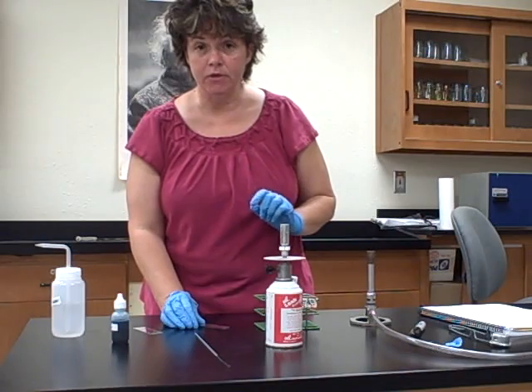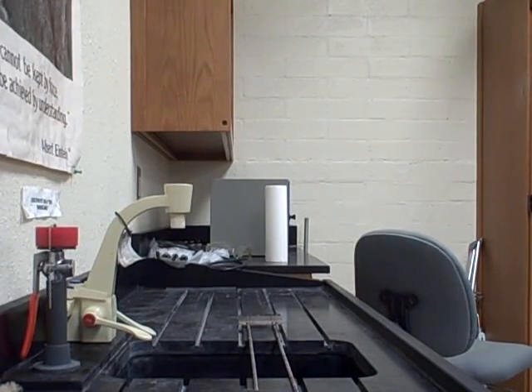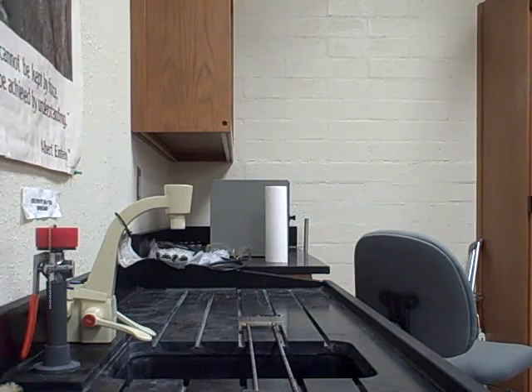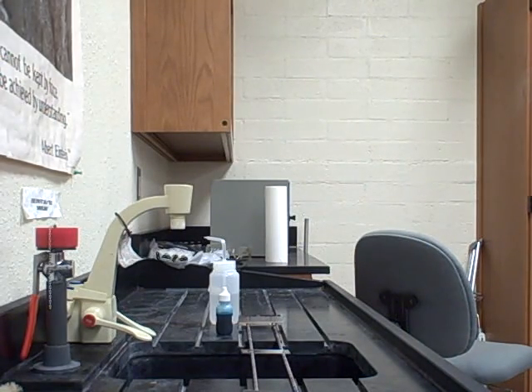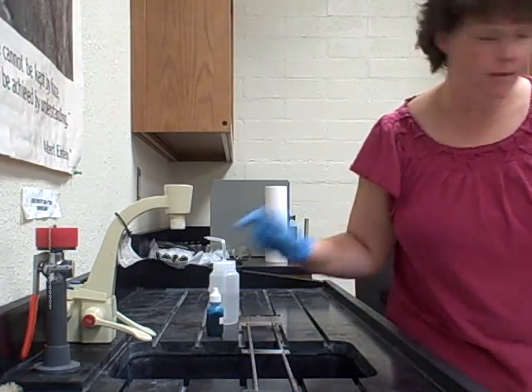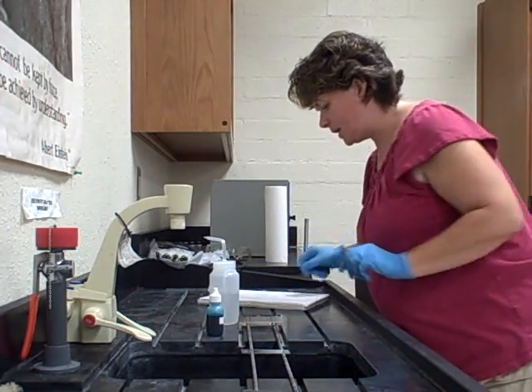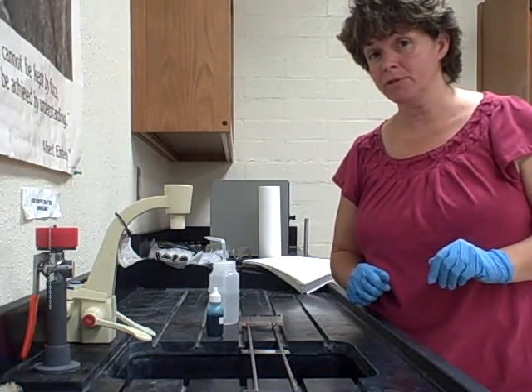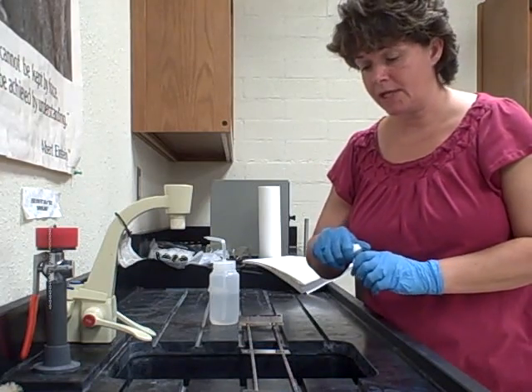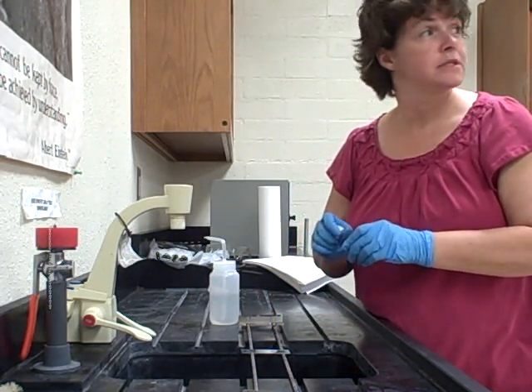Now that I've fixed them, I'm going to go to the actual staining procedure. For this particular staining procedure, I just need one simple stain. The stain I have is methylene blue. Going to page 28 of the lab manual, it says to cover the smear with methylene blue for 30 seconds. If you do it a little bit longer, that's okay — roughly 30 to 40 seconds. Using the dropper bottle, put enough on there to cover the smear, then time it for 30 seconds.